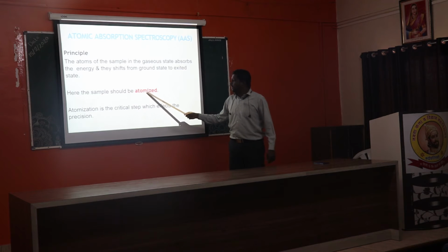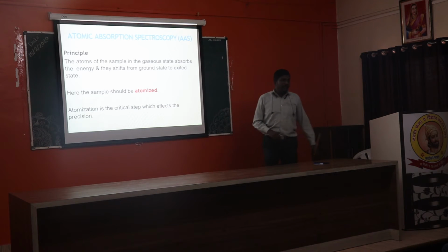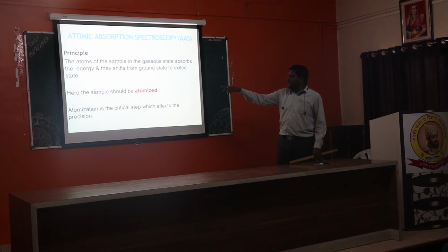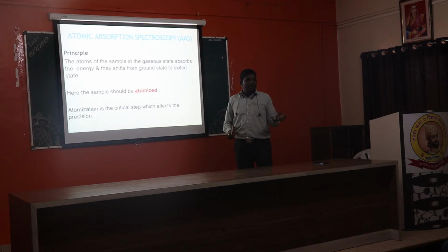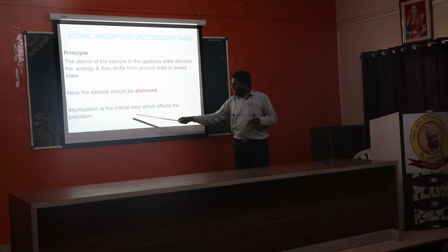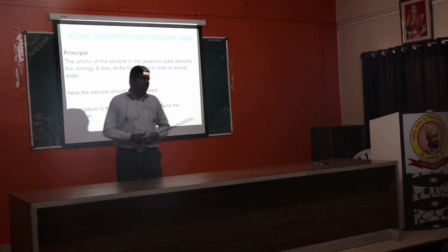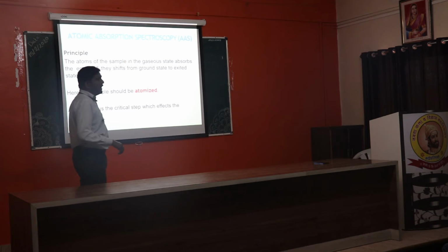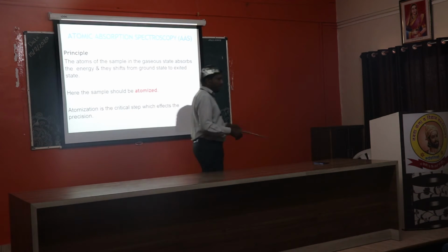Here, the sample should be atomized, and atomization is a critical step which affects the precision. The sample should be atomized, from the liquid state to the atomic or free state, it must be there. And this step is very critical. If this step fails, your precision also fails. You will not get proper results. So for that purpose, the atomization process is very important.